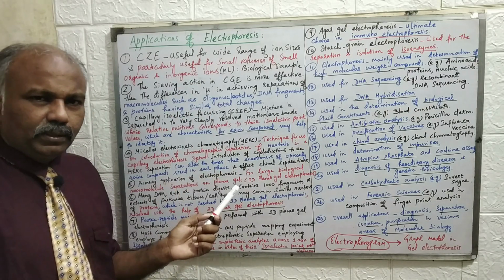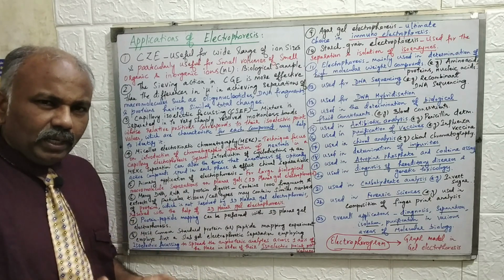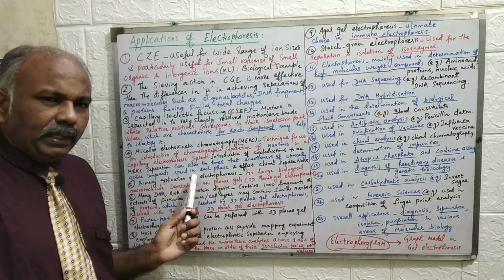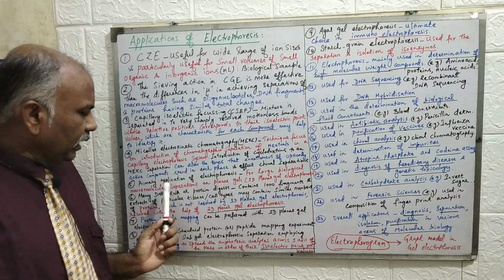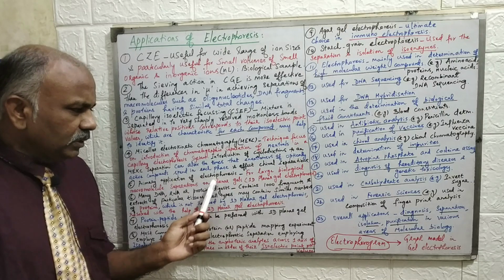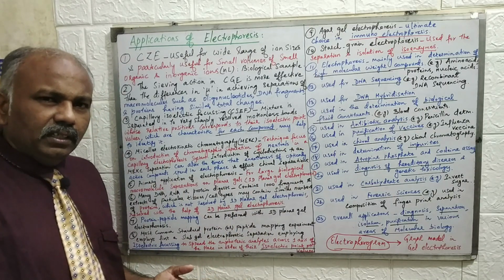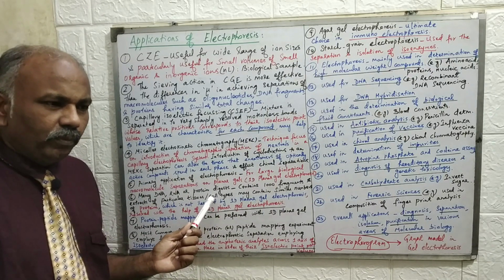These are all the types of electrophoresis: capillary gel electrophoresis, capillary zone electrophoresis, capillary isoelectric focusing, and then micellar electrokinetic chromatography, right? The fifth application, the very important or primary application of electrophoresis from long ago, is for large biological macromolecule separations. We can separate large biological macromolecules on planar gels. We call this one-dimensional planar gel electrophoresis. This is the primary application. Since long back we have been using it as one of the important applications in electrophoresis.